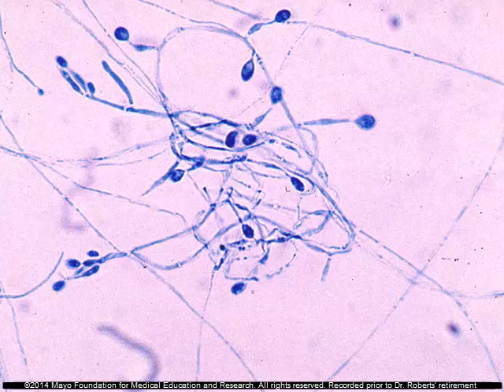And if you look at the spore, and then you follow it down, you see what looks almost like a phialide. You follow it down, look at the bottom, you see that it's swollen. Very tiny, delicate organism. And if it's swollen at the base like this, it's Scedosporium prolificans. There's actually one at the top at 12 o'clock with a swollen base.